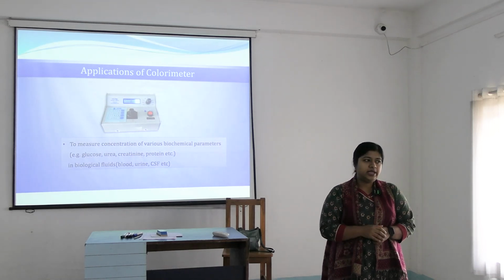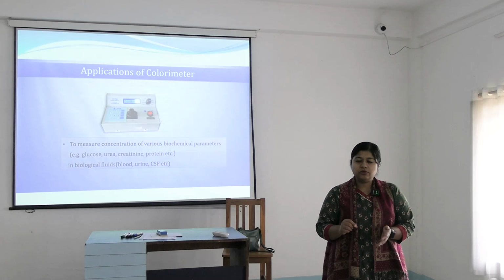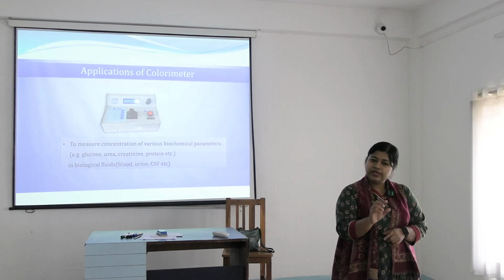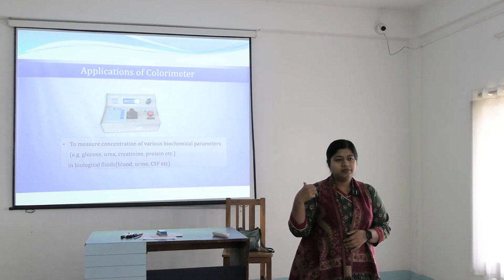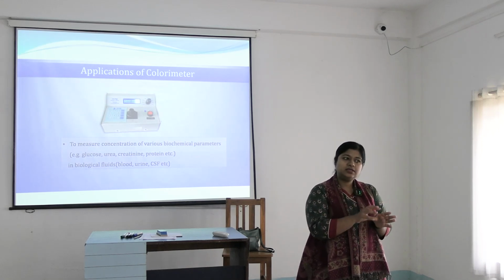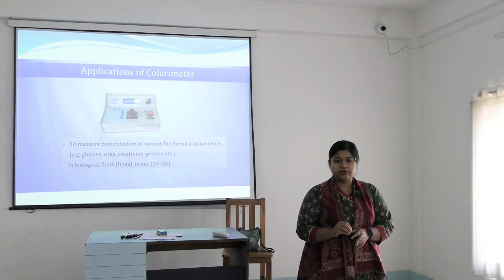We will get an OD, and then we have to place the values in our equation and find the concentration of the unknown, because we know the concentration of the standard and from that we can find the OD of the standard, and we have already found the OD of the unknown. So, from that equation we can find the concentration of the unknown. So, everything we have to do manually.